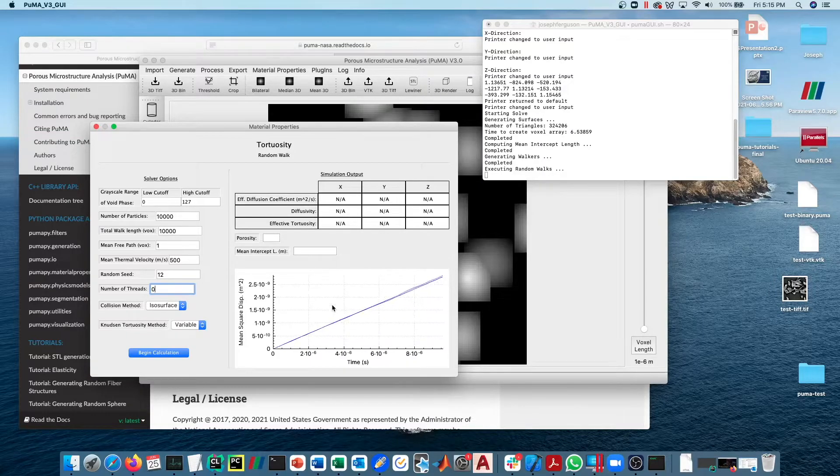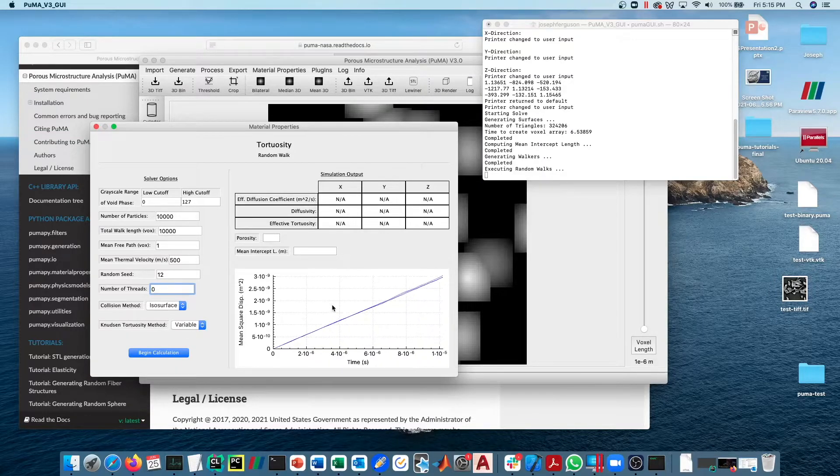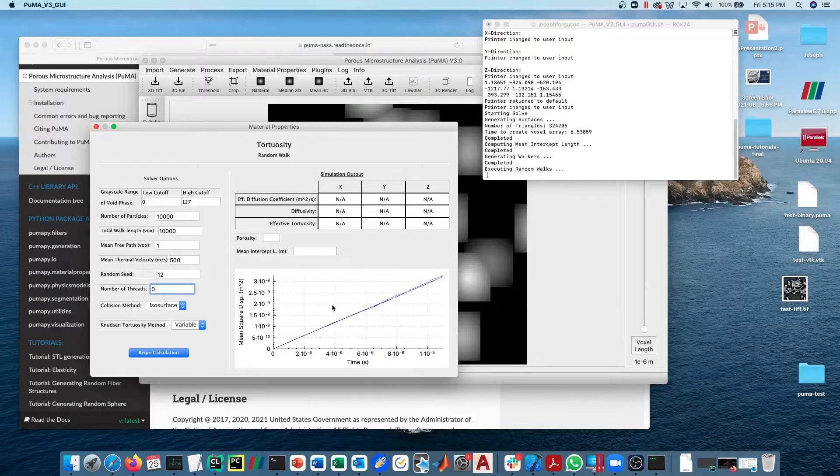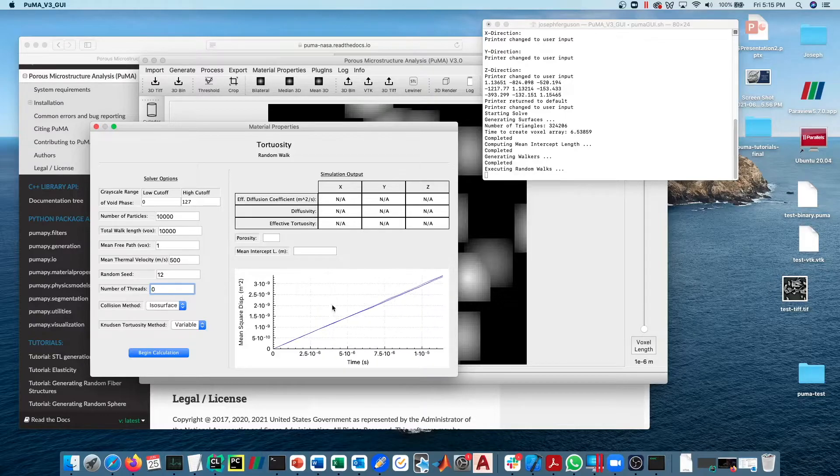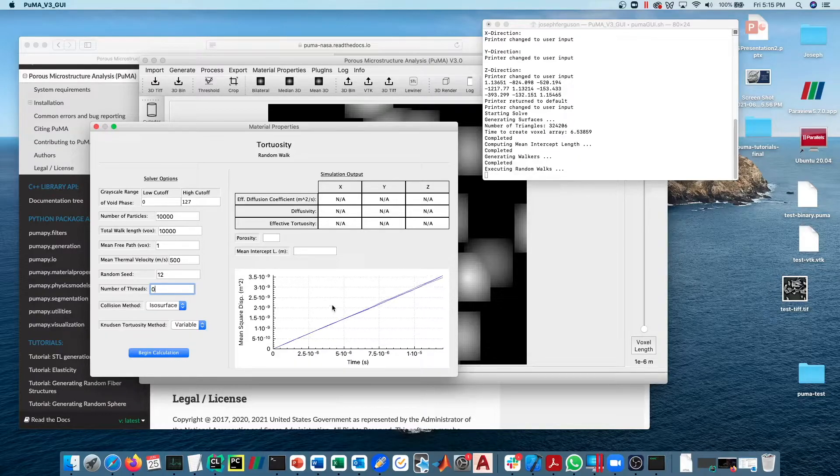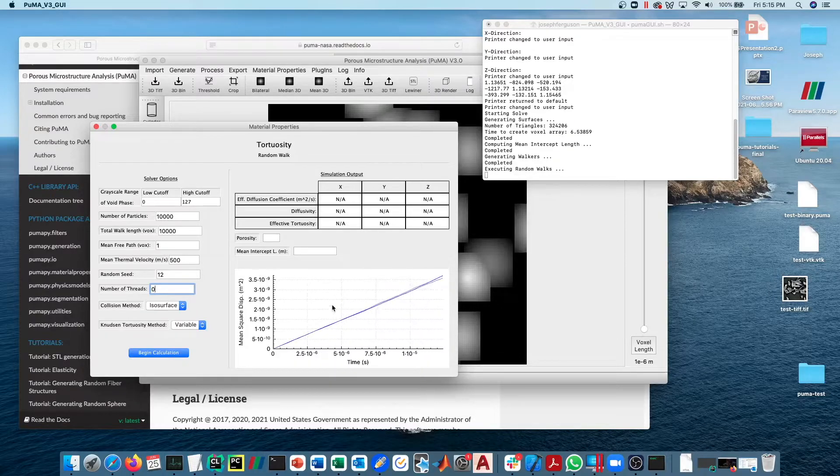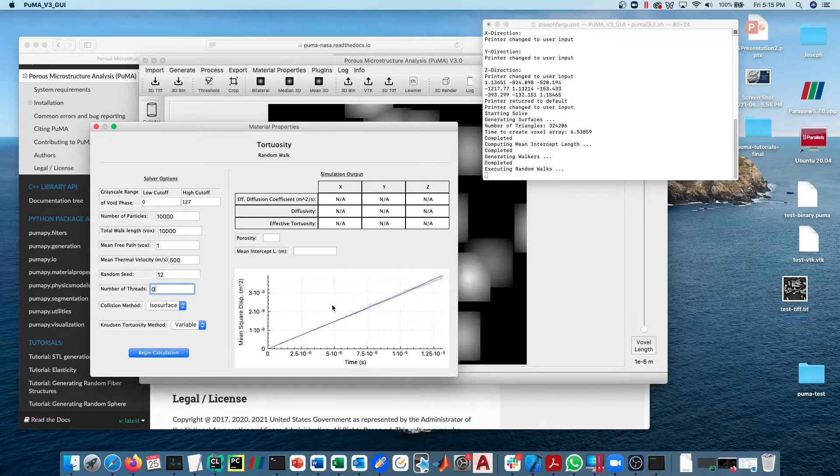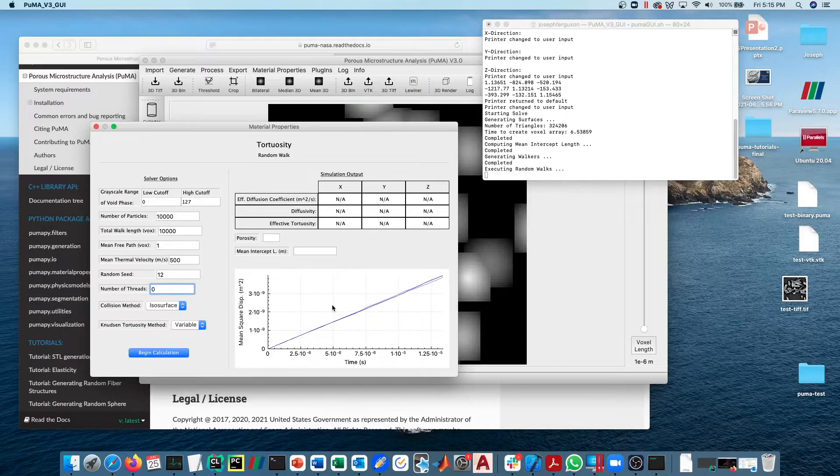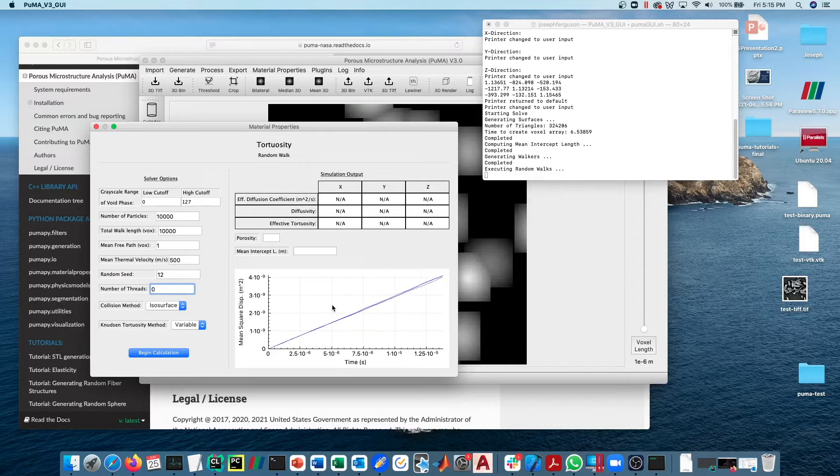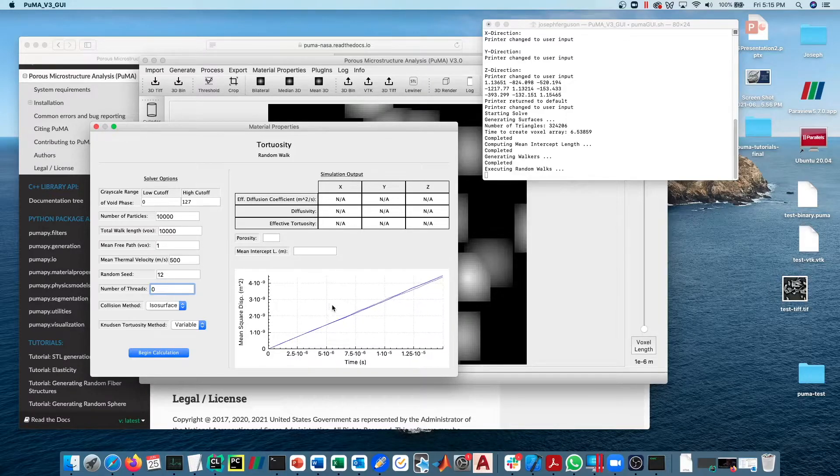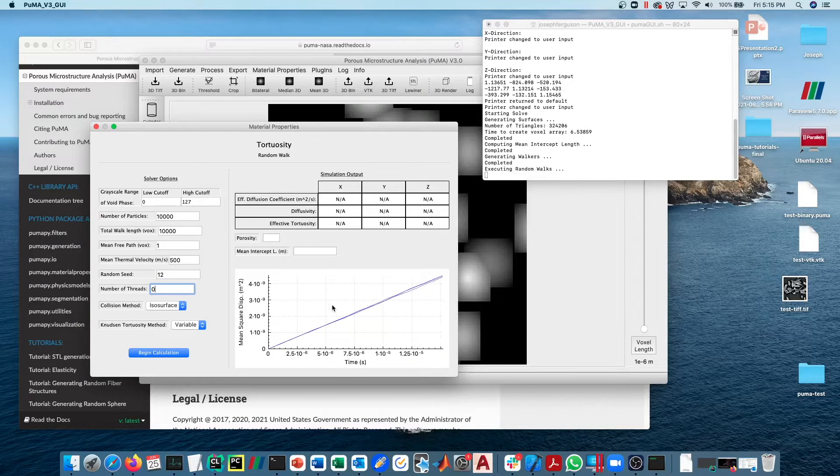It's also plotting the mean square displacement for each direction. Since this is an isotropic material, we expect the lines to be more or less on top of each other, and we can see that that is in fact what's happening. If this was not an isotropic material, we would expect to see the lines diverging from one another.